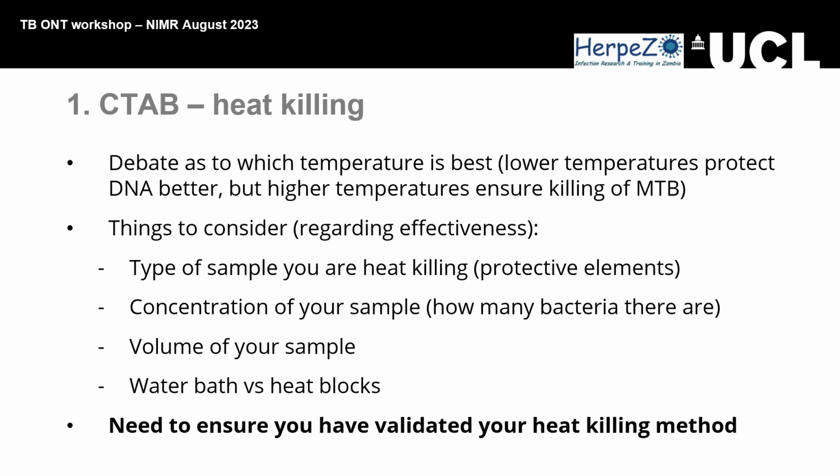So the temperature won't get to 80 at the top of the Eppendorf tube. But with a water bath, you get equal temperatures. I'm not okay with the heating block, so I go with the water bath. I think it's just a case of validating that your method is definitely killing everything. Yeah.